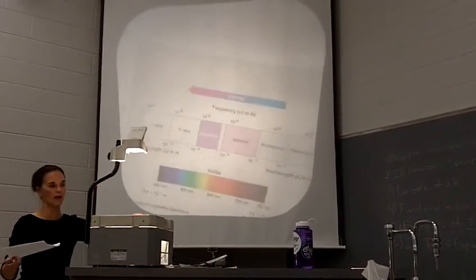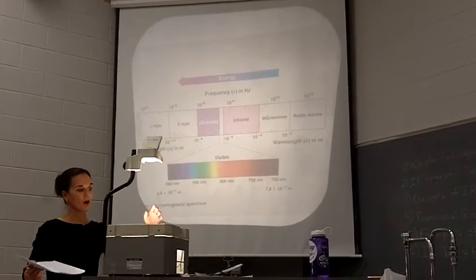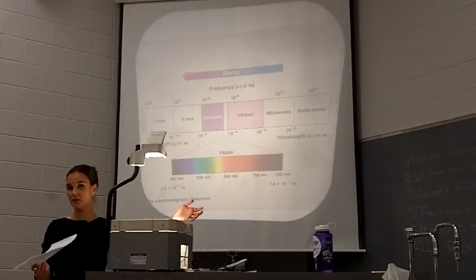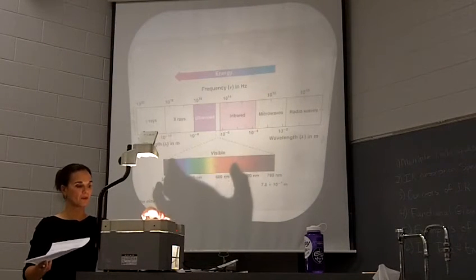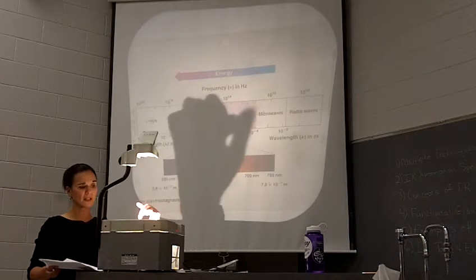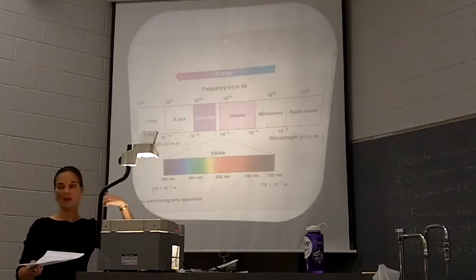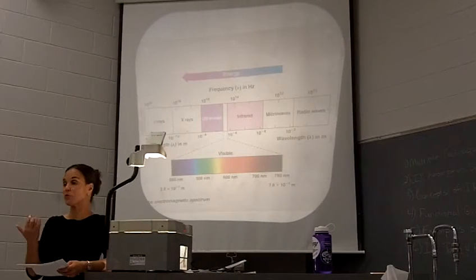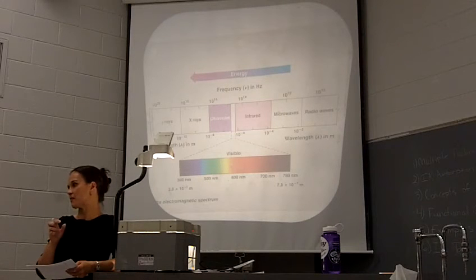All right. So now let's talk about IR spectroscopy so you have an idea of what you're looking for with those spectra. As you probably covered in Gen Chem, the electromagnetic spectrum, and the visible spectrum is right between the ultraviolet and the infrared spectrum, okay? As far as energy, infrared is much lower energy than ultraviolet. So what we're looking at with the infrared spectrum, and what is happening as your compound is absorbing infrared energy, is what is happening to the bonds as they absorb the energy.